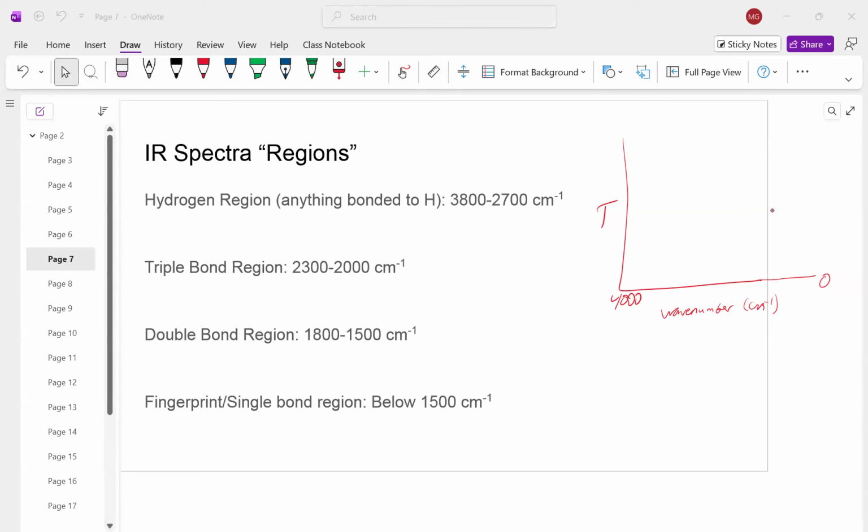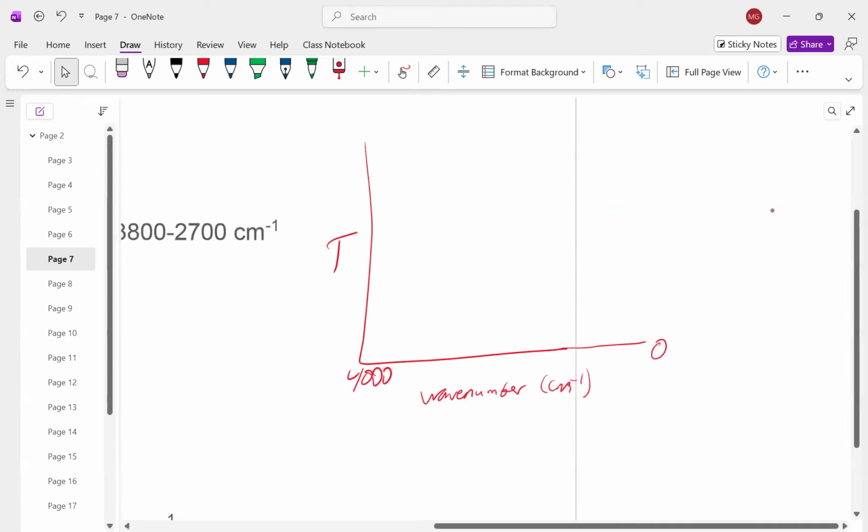Right, so let's take a look at one of the best ways to read an IR spectra. First thing I want to highlight is what these IR spectras look like to begin with. We look at it as a graph with an X and a Y axis. On the X axis is something known as wave numbers, which is the chosen unit for the absorptions that you see in an IR. And these wave numbers have a unit of inverse centimeters.